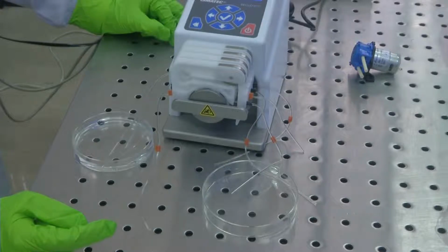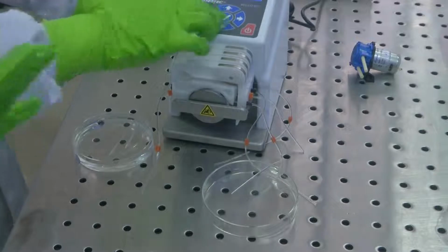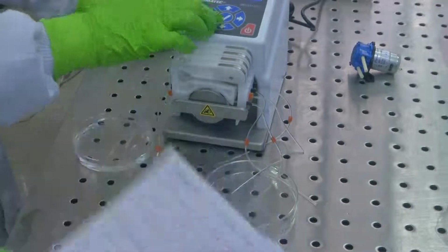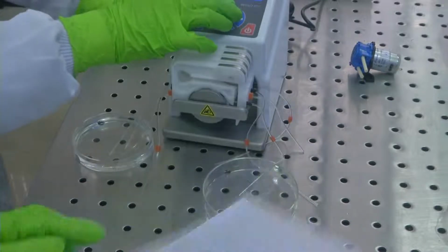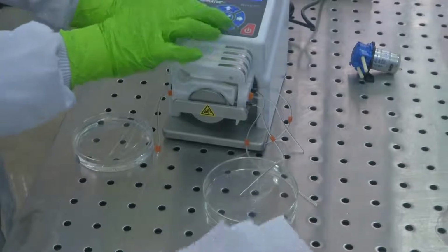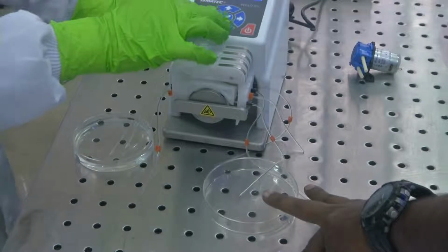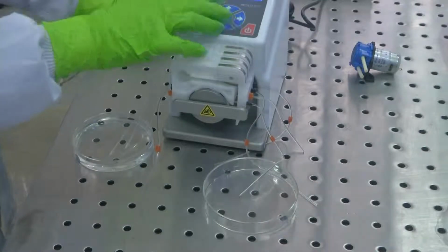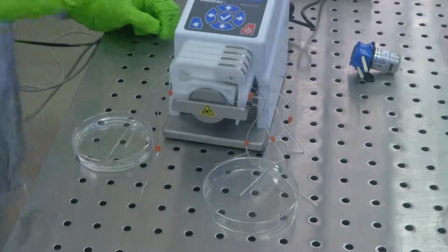That is the thing I am thinking. I think that's too high. You can actually put only 20 microliter for say 5 seconds. 20 microliter 5 seconds. He put 4 microliter in 3 seconds. Okay, what is the flow rate? This thing is not visible. The water is also not visible. Okay. Sure. Okay. Oh, we can change the RPM then.